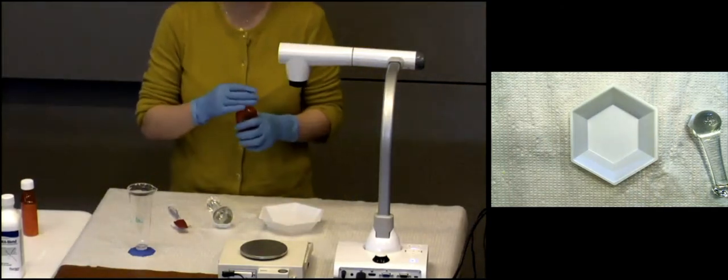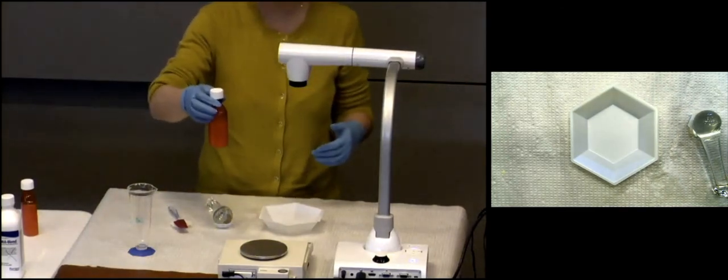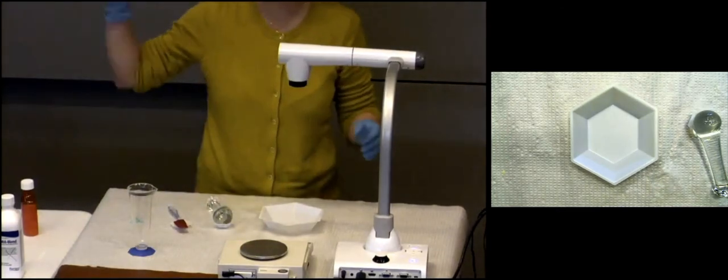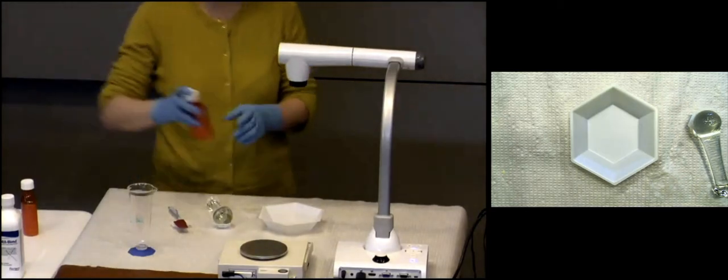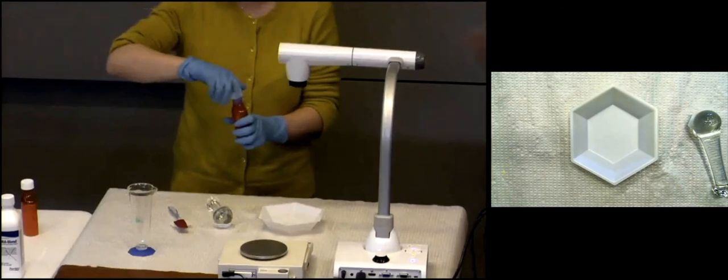And then my patient came in the afternoon and is ready to pick it up. Can I just dispense as it is? What do I need to do before I dispense? Shake well. All right, so pretend I dispense. Don't pour it out yet. So everyone turn to your... so it's ready to go. Would you agree it's ready to go here?